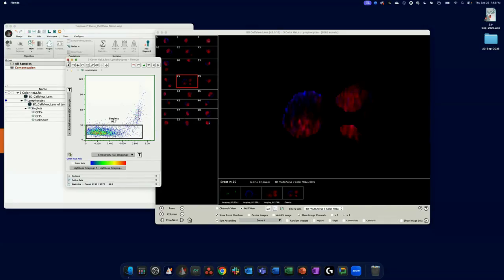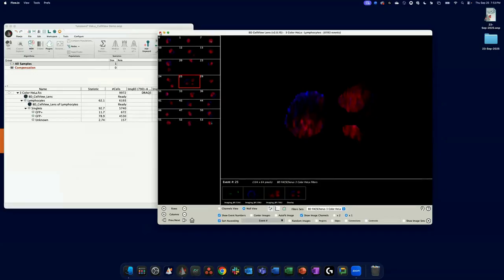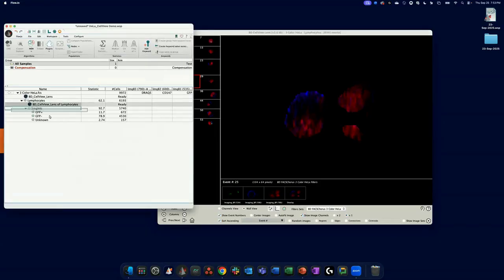Okay? So let's take a look at a more practical example of that. Let's say I'm interested in knowing whether a cell is truly GFP positive or not. Has the GFP entered the cell, or is it just maybe some background noise or some kind of artifact of the surface staining, right? So now I can take that node and maybe I'll just pop it onto these GFP positive, negative, and unknown gate, right?